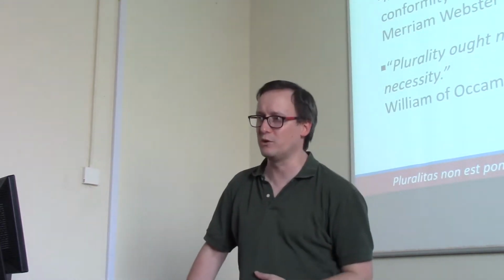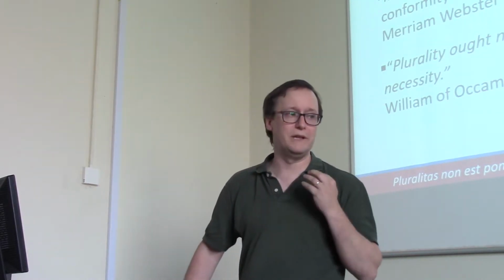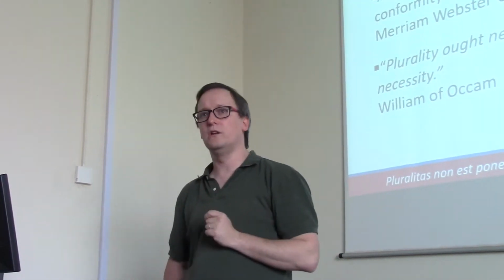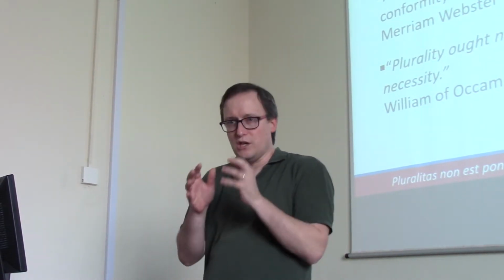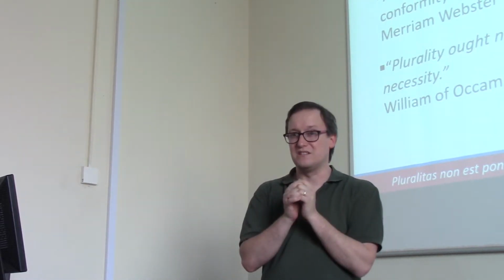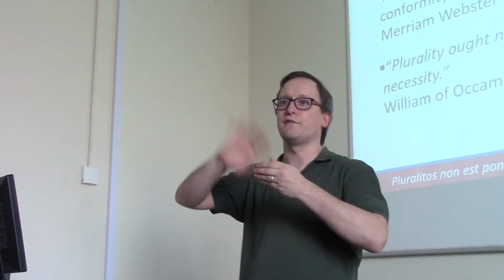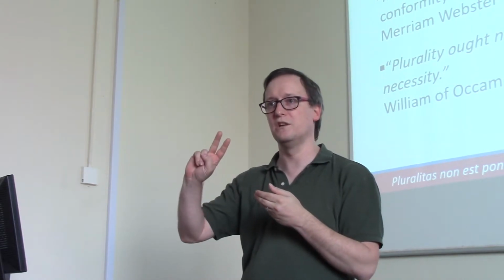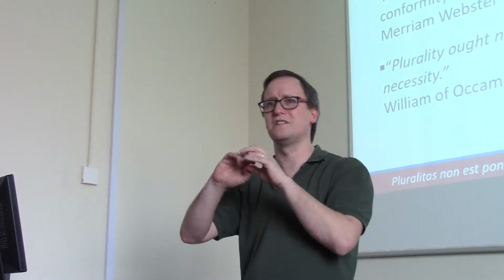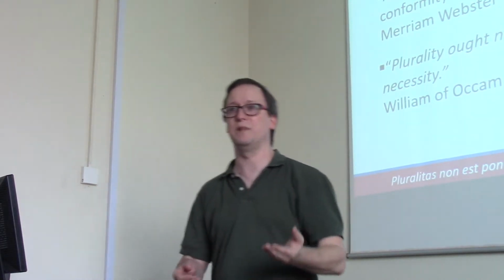Now, I love talking about parsimony. This is a principle that we really don't talk about enough in biomedicine. But I'm going to be really brief about it, simply because it's already 3:02, and I don't want to run us late. So, parsimony means that we need to be very stingy when we're doling out explanations from our data. The principle of parsimony says that if you have the peptides that would allow you to claim 15 different proteins, but only 2 of those proteins would have all the explanatory power of the full set, you limit your explanation to just the 2 proteins rather than the full set. You don't want to go beyond the necessary to explain your data.